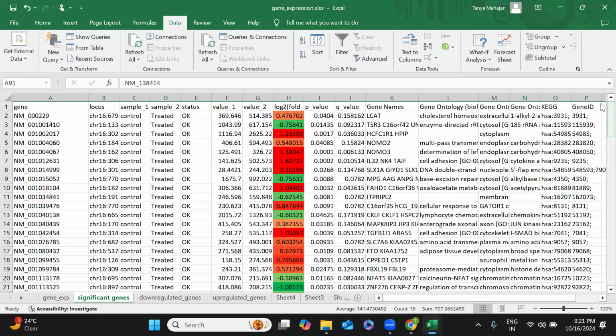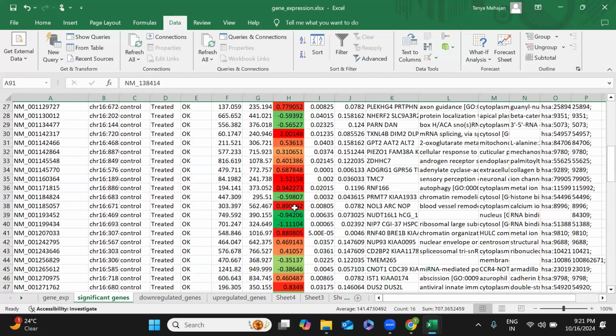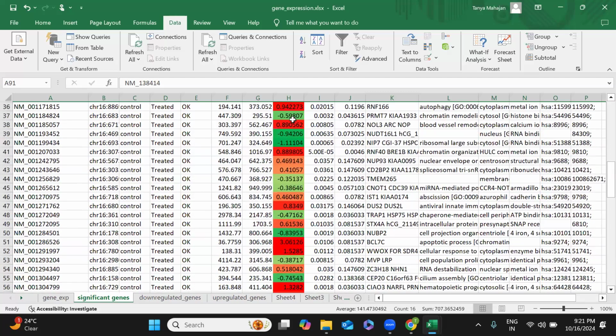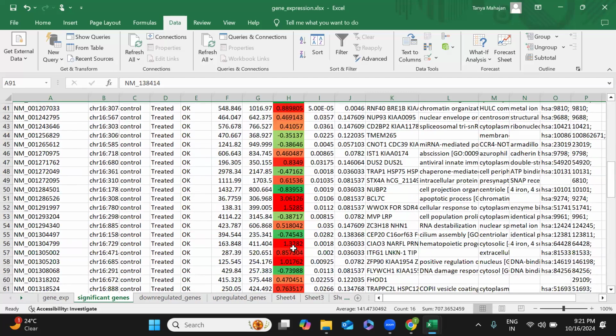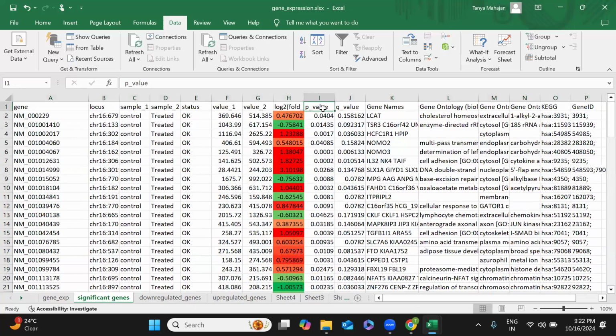Yes. So it totally depends on what type of data you are getting, and you have to look at the log2 fold change values, to see which genes are showing nearly 0.9. If the data is near 0.9, I will put the cutoff as 0.9, not 1, sir. It depends on the data. But make sure for the significant genes, for the p value, the value will always be 0.05, sir.